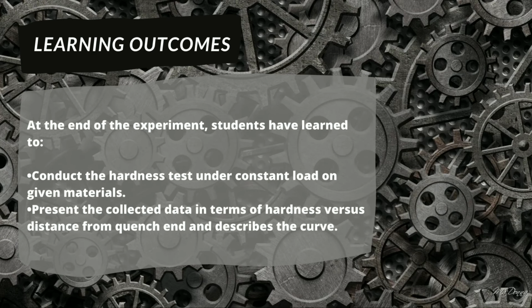In this experiment, we will learn how to conduct the hardness test under constant load on given materials and present the collected data in terms of hardness versus distance from quench, and describe the curve.